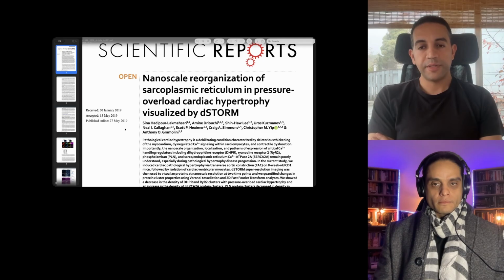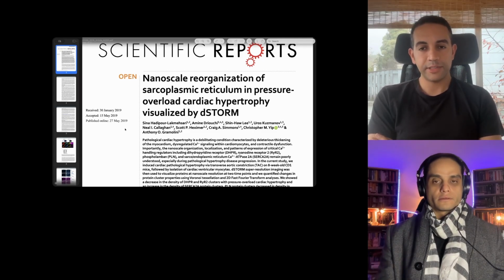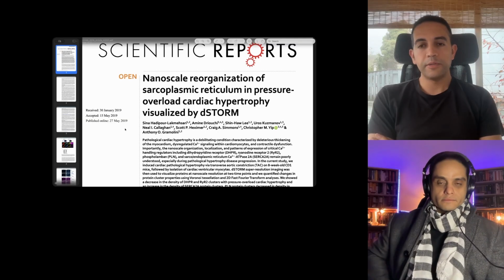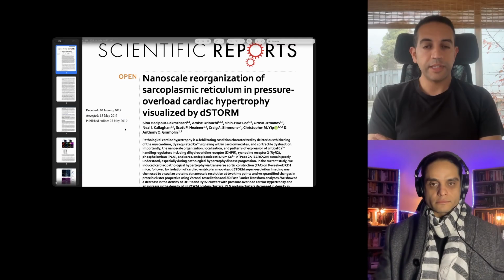But you do so at the expense of losing photons, which impacts your localization precision, and the resolution you achieve in Z is worse than in XY. Depending on the question, if you need Z information to capture the ultrastructure of something, you might be stuck.